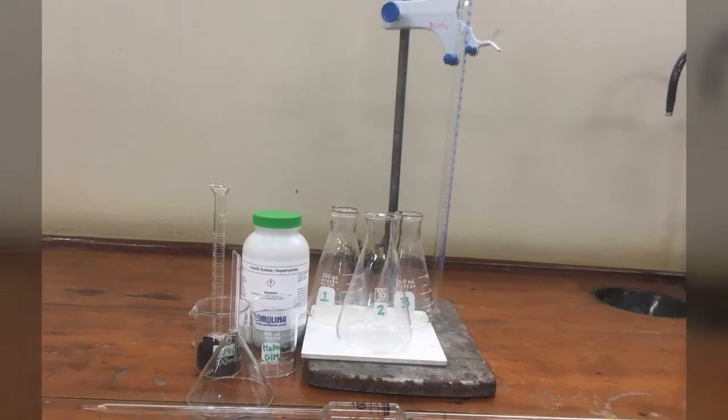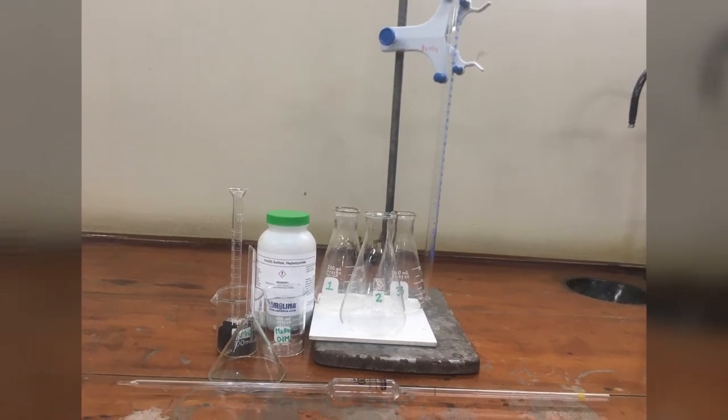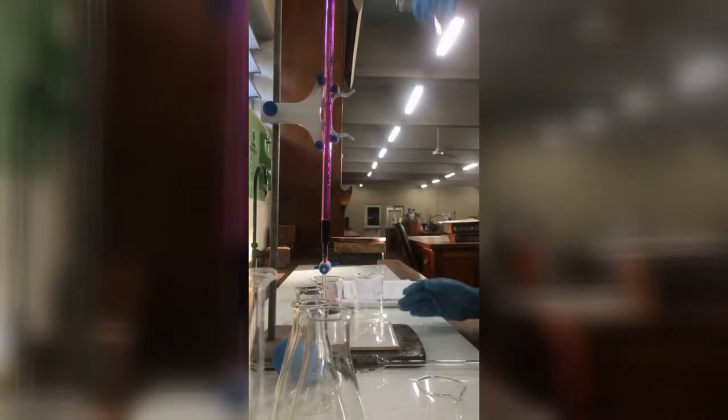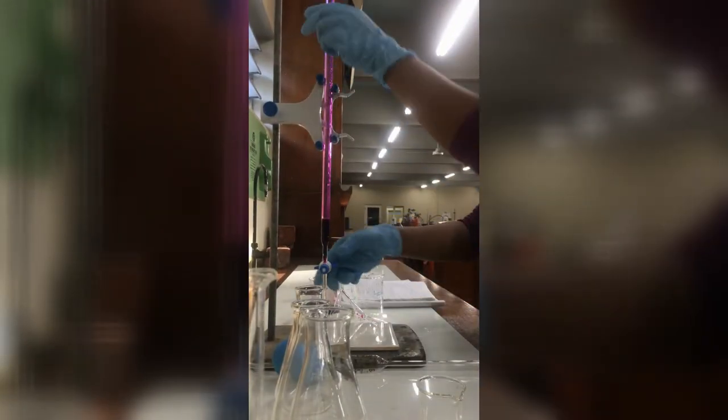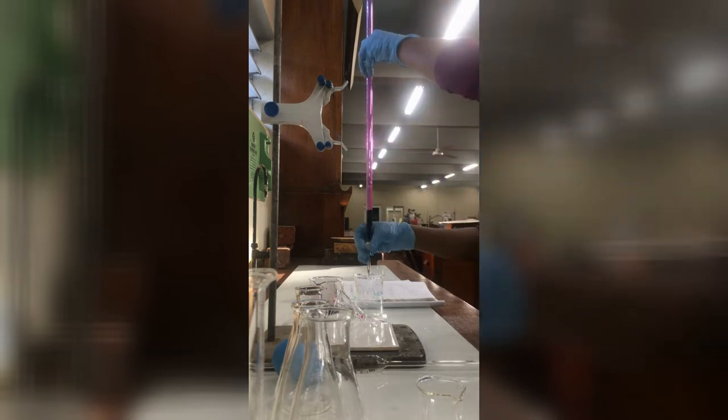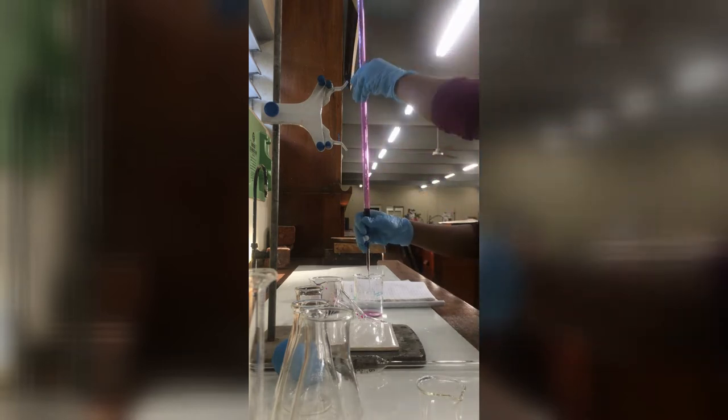This is a picture of the chemicals and glassware that we are working with today. As you can see, we are conditioning our burette with the potassium permanganate solution. Conditioning essentially reduces the probability of contamination of the solution.